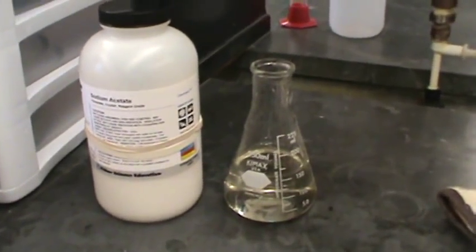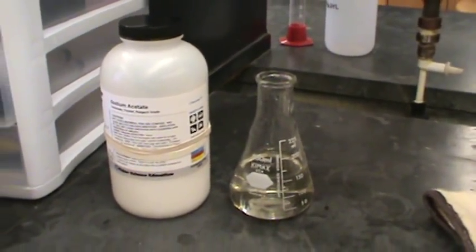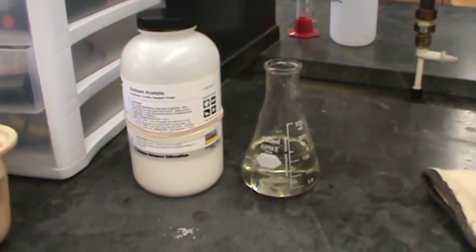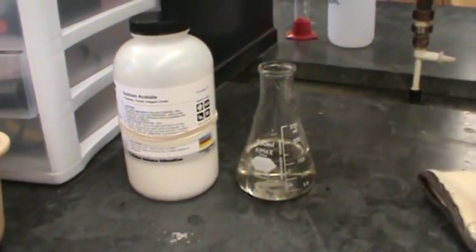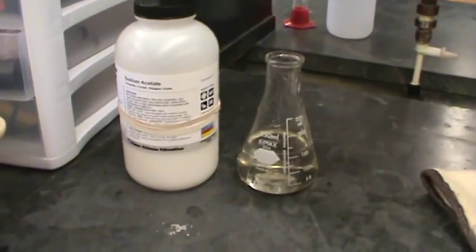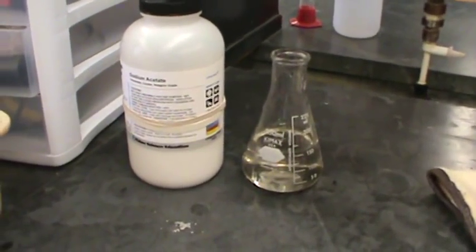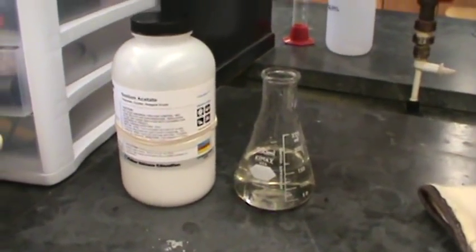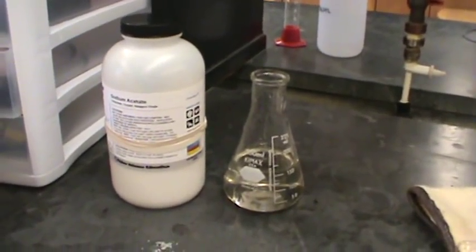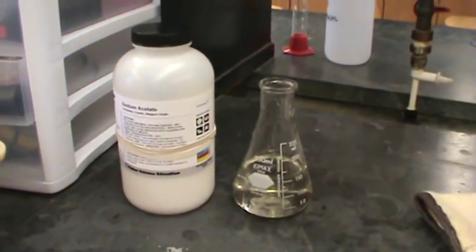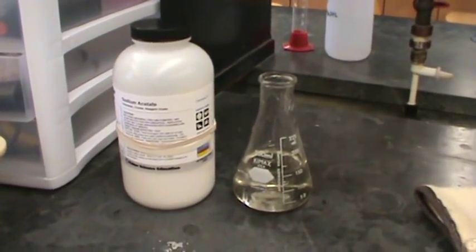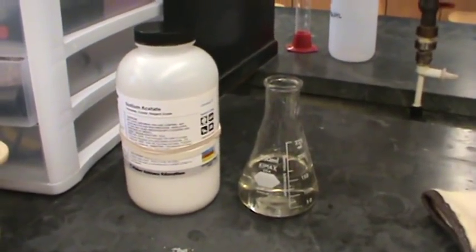Essentially, if you're going to try to make a supersaturated solution of sodium acetate, what you want to do is get some water, put it on a hot plate, and heat it up. And then slowly add, or maybe not so slowly, add some sodium acetate. It takes quite a bit to get a supersaturated solution. So just go ahead and dissolve a lot of sodium acetate into the water.